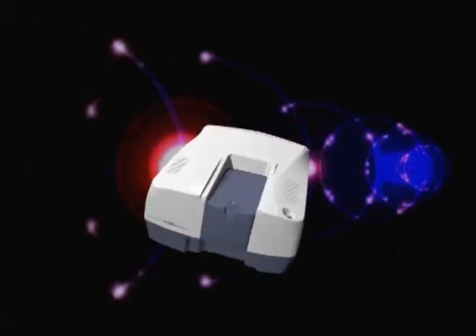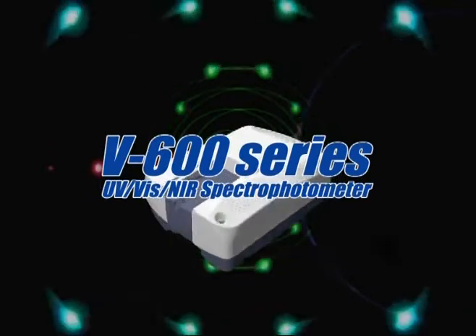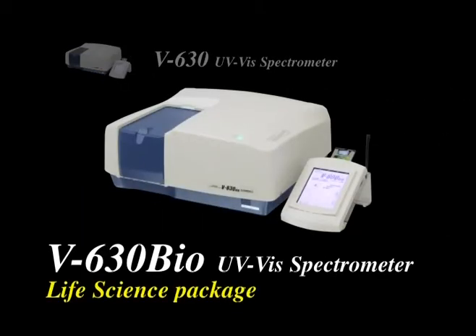With over 40 years of experience in spectrophotometer design, JASCO is pleased to introduce a completely new line of UV-VIS NIR instruments. The V600 series consists of five distinct models designed to meet application requirements for a variety of industries.